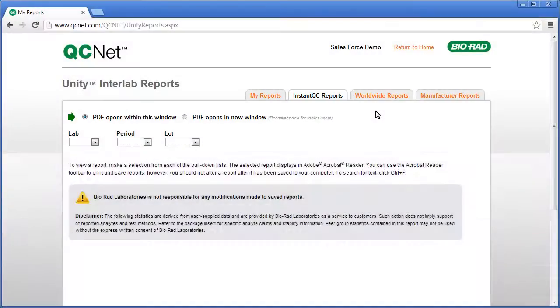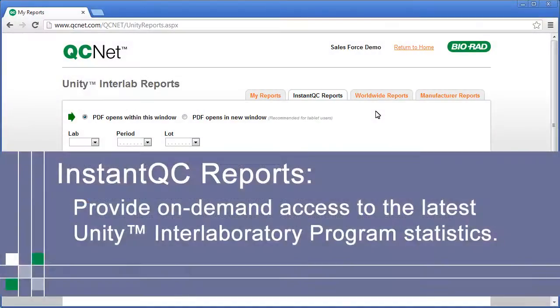Instant QC Reports provide on-demand access to the latest Unity Interlaboratory Program statistics.